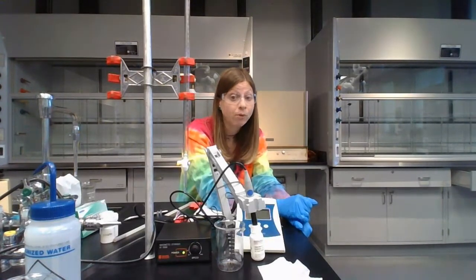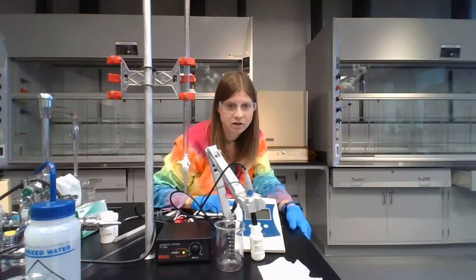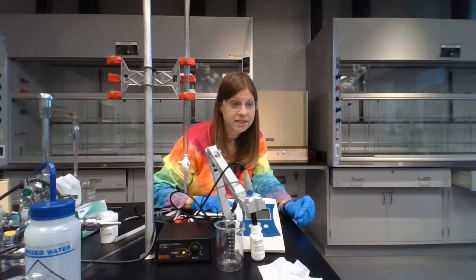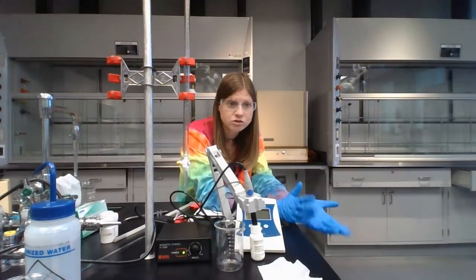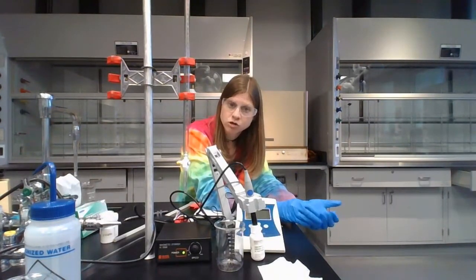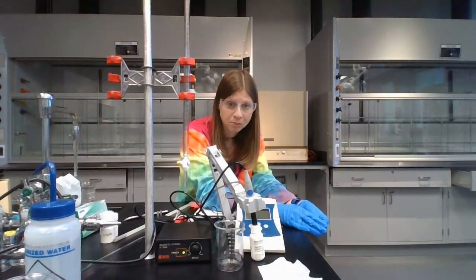Yep, you heard me, 0.1. So that's going to be like bloop, or maybe bloop, bloop. It doesn't make that sound, but you get what's happening. You're going to add very small amounts, and you're going to continue to do that, writing down the pH every time until you get to the end of your equivalence point. So in my pretend numbers, the jump was between 21 milliliters and 22 milliliters, so I would do 0.1 milliliter increments, starting at 20 milliliters and going to 22 milliliters.